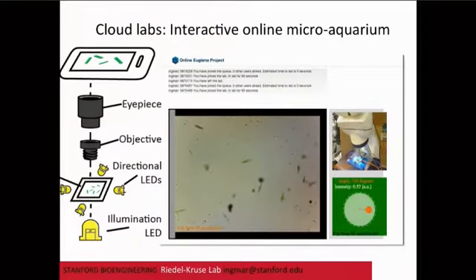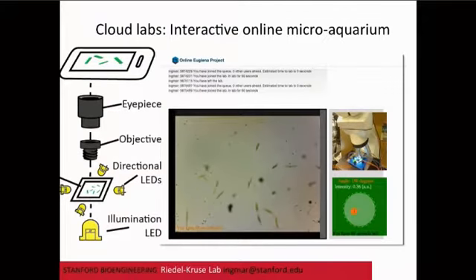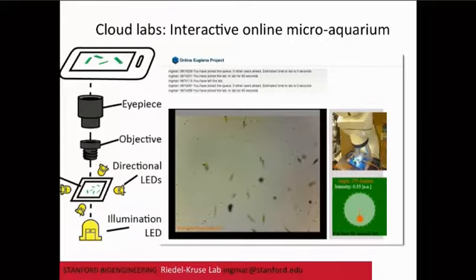So this is essentially the website. It has one big live view of the camera, which is seeing your cells move. You have this joystick here. With this joystick, you control the direction of the light. And you have an external camera view onto the microscope. So here, if you watch closely, you see the different LEDs turn on and off, which is important to give a remote user a sense of what they're actually doing, right? And if you follow closely, now, for example, the joystick points down here.